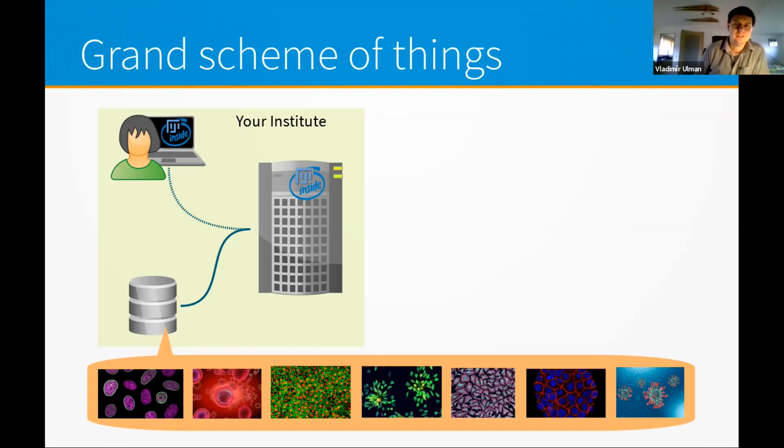And then comes the moment when, on the macro recorder, there is a button that starts a macro editor, and the content of the macro recorder is in that editor. We probably wrap this code with something that loads an image. Then comes the processing of it, and then there's a piece of code that we have to add that stores the image. This is the beginning of our automation, right? We wrap it with a for cycle, and this way we iteratively process images. So this is what we expect is a routine for you, that you are probably doing a lot.